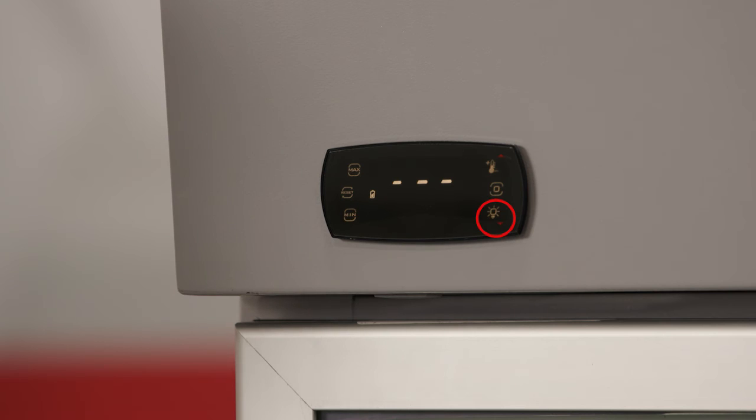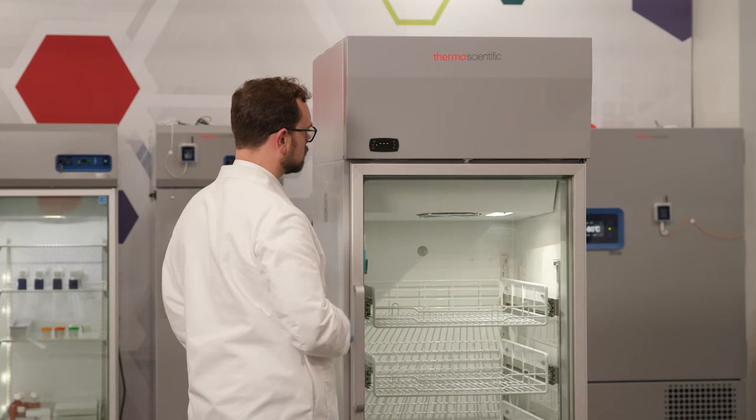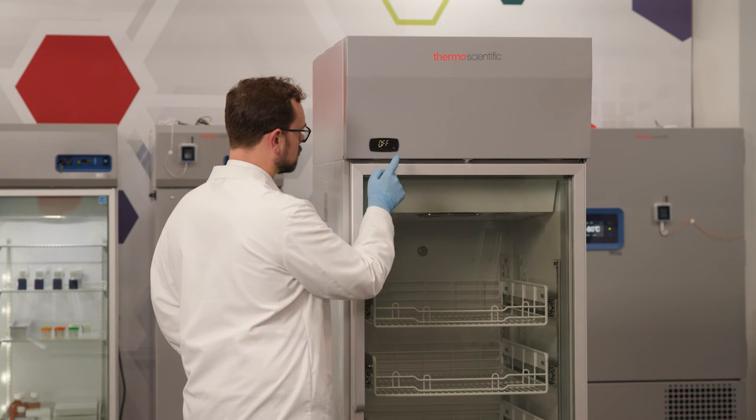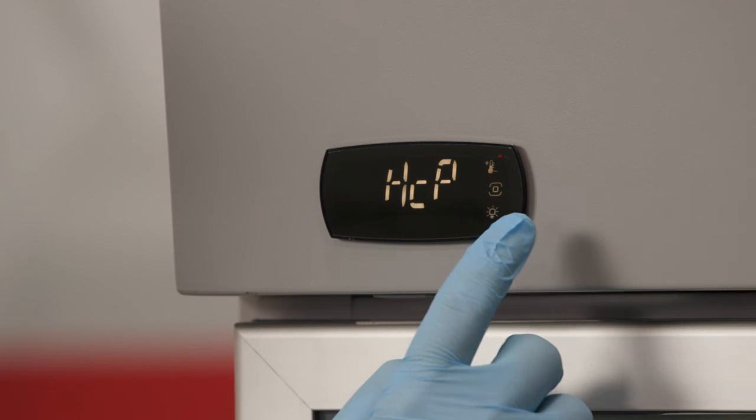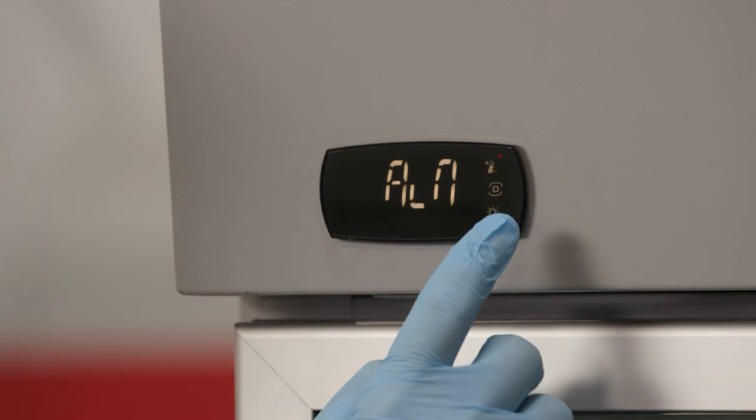The lights button in the bottom right position switches the interior lights on and off. This button also functions as the down arrow when scrolling through menus or changing parameters and settings.